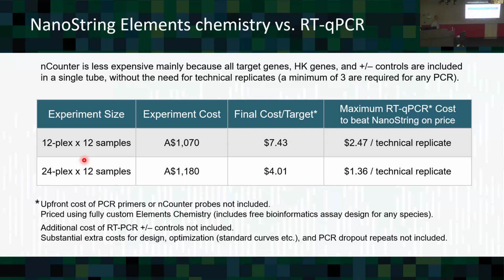And there's some tricks. You can't order them from just anybody. You should order them from IDT. They found out in the early days, this is a trivial thing, but it's interesting, that if they made probe A's and probe B's in the same place, there'd be contamination and things would go funny. This is the early days of nanoString. Now they make them in completely different facilities and then send them to you, because otherwise there's carryover from one synthesis to the next.